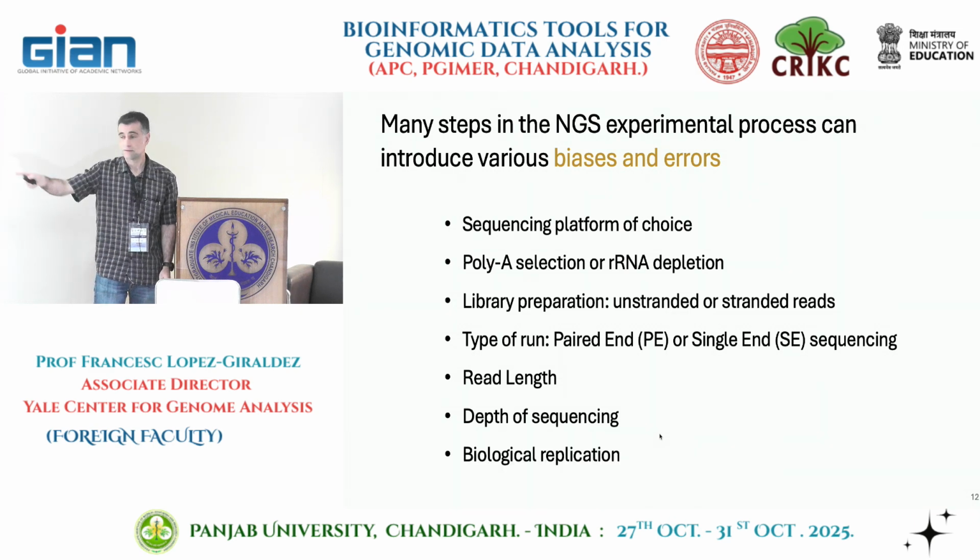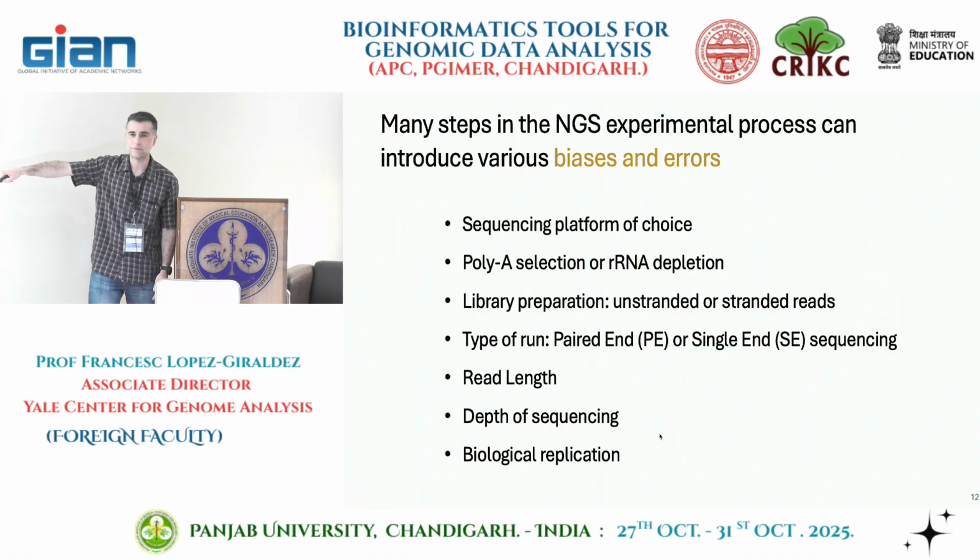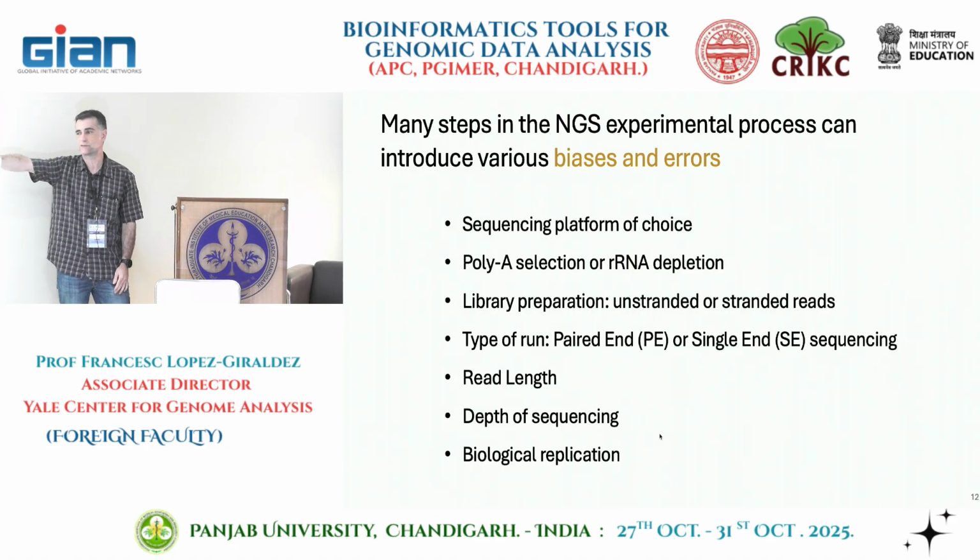Biological replication. It's something that, for whatever reason, a smart scientist in the lab does replicates all the time, but they come to sequencing, show up with one or two replicates, and say, okay, what do you want me to do with this? So I could have summarized my slide about the problems we encounter with just the bottom one.